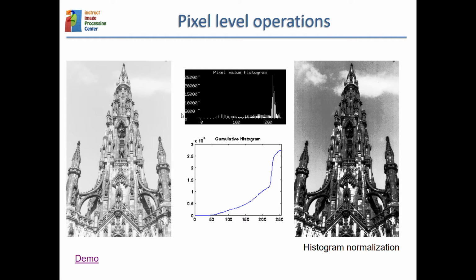And here it is the same. Here we didn't have those empty areas, maybe a bit at the beginning. So that area can be sacrificed, but otherwise the remaining values have to be collapsed into a single value. Typically you saturate at 255 and 0, and that is why this image looks almost like binary.